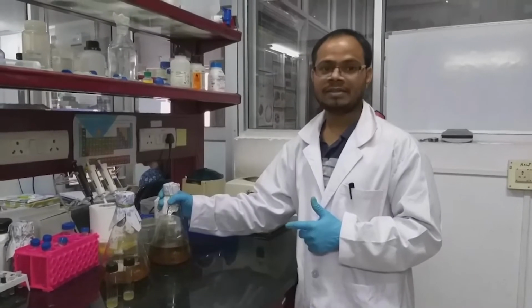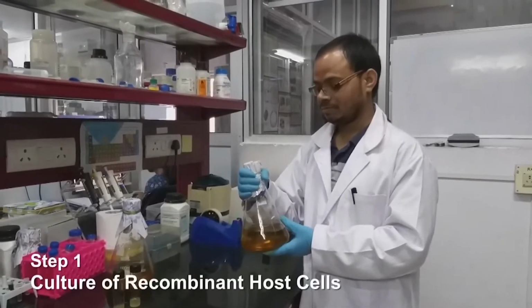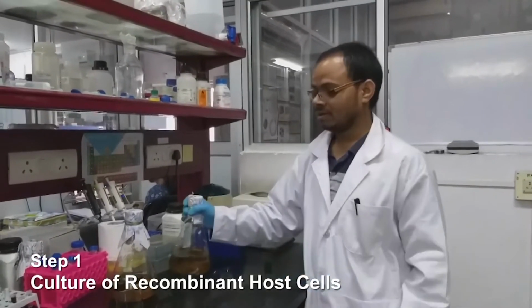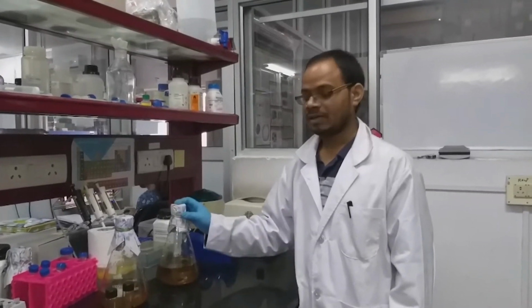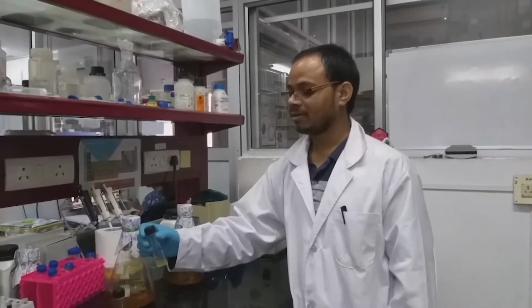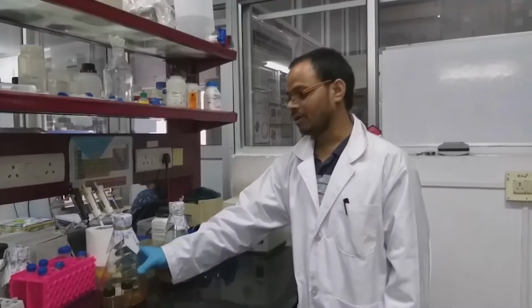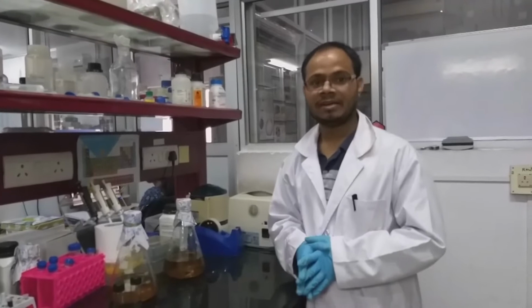For protein purification, first we have to inoculate the culture into this larger volume of LB medium, then we will induce it. So, first I will show you how to inoculate. This is the single colony grown overnight culture. So, we can use it for inoculating into large cultures. This process should be done in aseptic conditions.